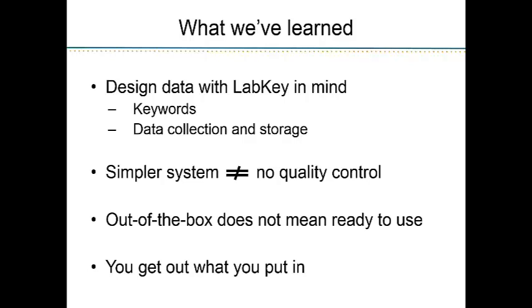So we've had this server for 1.5 years, and a lot of the challenges have been just trying to enter the data that is specific to us in the LabKey modules that have been created for other groups that don't necessarily do flow the same way or do Luminex the same way as us. And then finally, really get out what you put in. So I would love to spend more time in LabKey and be able to show you a lot more features that we wanted to use, but it's really just a timing issue. So I think that's really important to keep in mind.